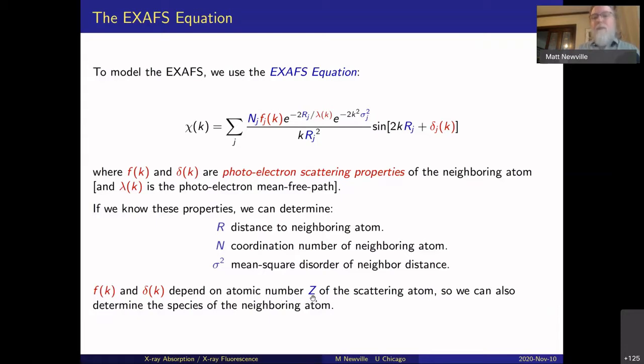So there is some sensitivity. We can distinguish between iron-oxygen scattering and iron-iron scattering, as we'll see, and we might even get to that later this afternoon. It's challenging to get that to high precision, but we can see rows of the periodic table easily.